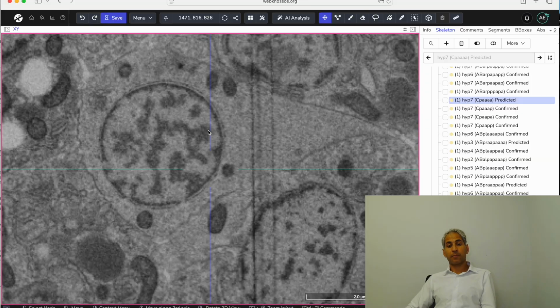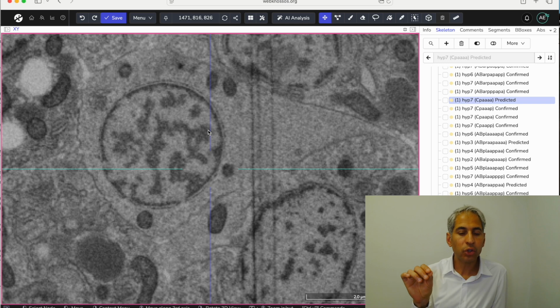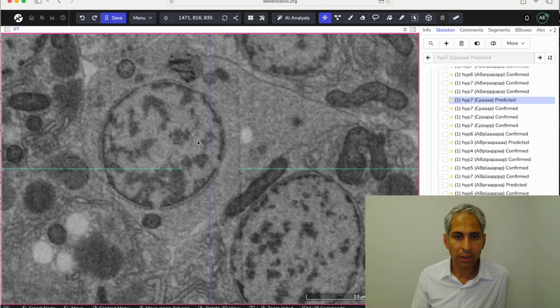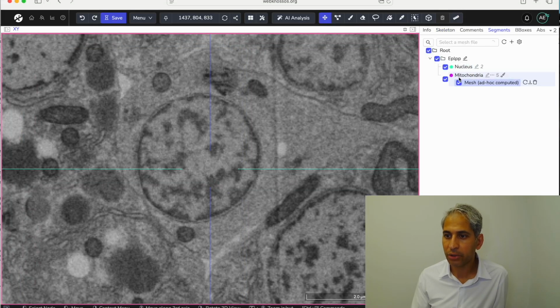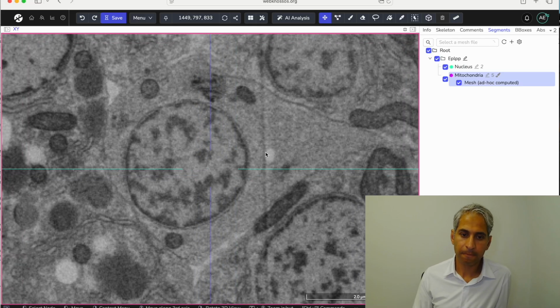Explore your cell, take your time, find the organelle you're most confident is a mitochondria. Start by annotating that using quick select. Don't use trace. Do not hasten to use interpolate. It may cause more problems than it is worth. As you see, the mitochondria are small, and so clicking a few times should get the job done. 10 mitochondria at least for this week, all under the same segment and only for your cell. Enjoy!